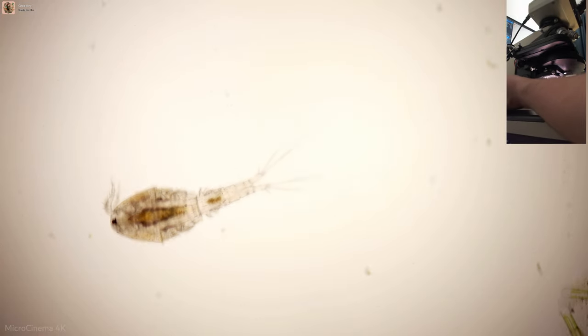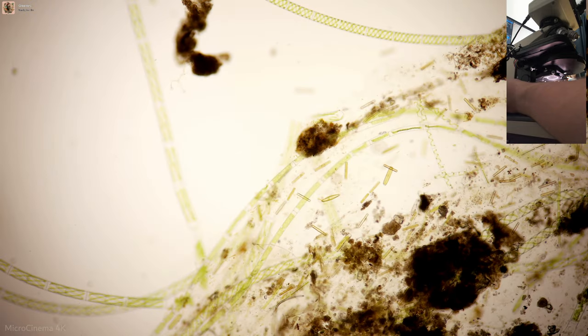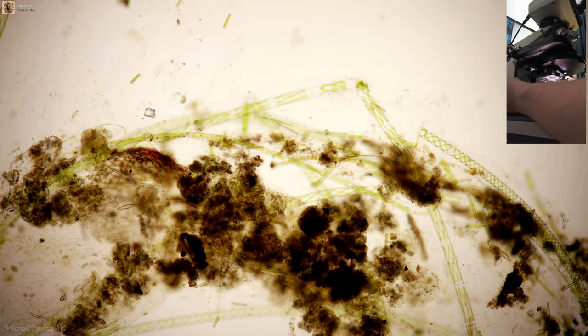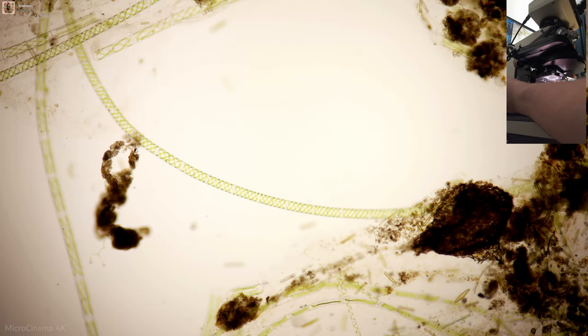Hey folks, Jason here, aka Diatoms. And I just wanted to share a small little upgrade that I made to my microscope.